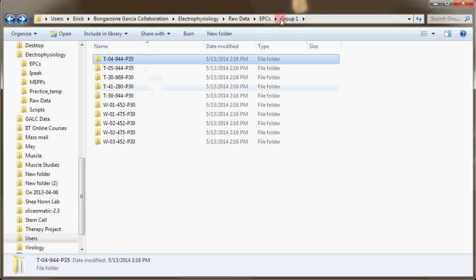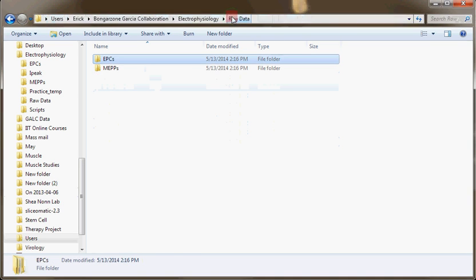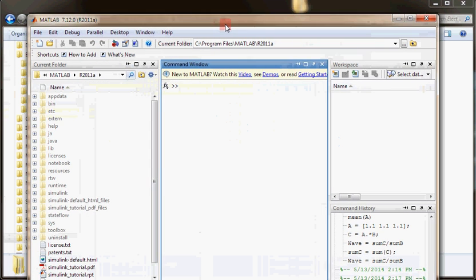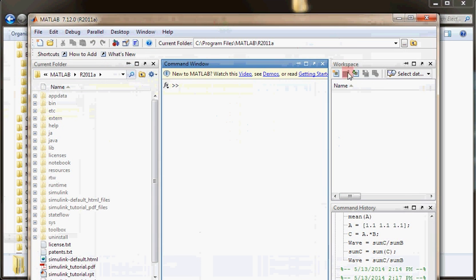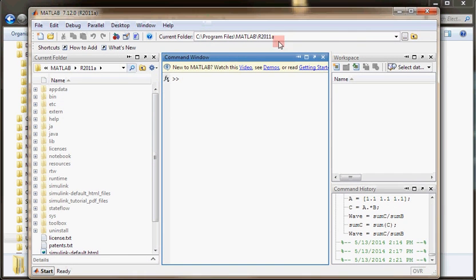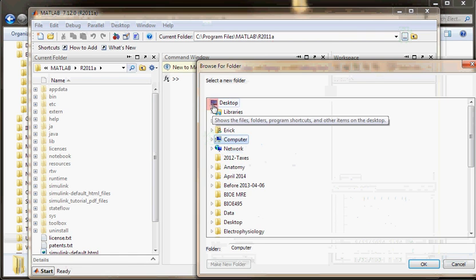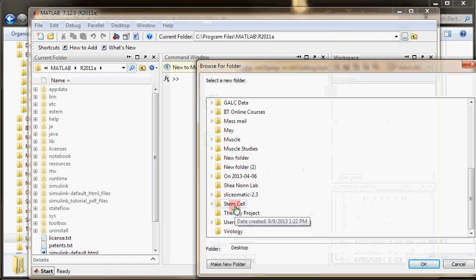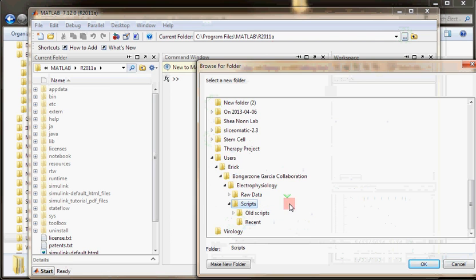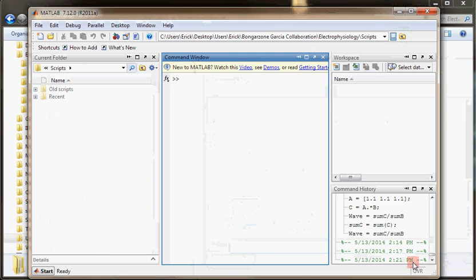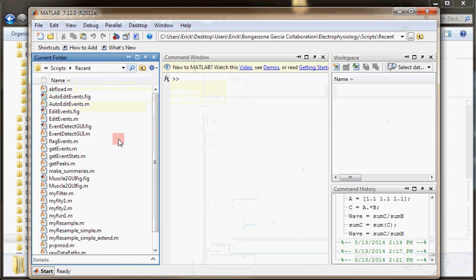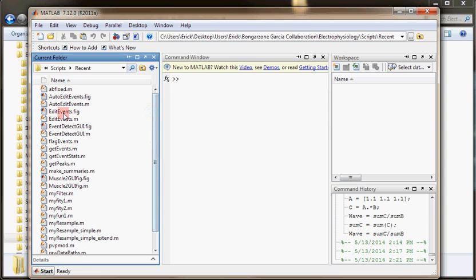Now what I need to do is open up MATLAB. I'm going to need to navigate to where I have my scripts files. If I open up MATLAB, I'm going to navigate to where the scripts files are. If I go to desktop, I created a users folder. And here we go, scripts. In the scripts folder, I'll double click on scripts and it'll open up.